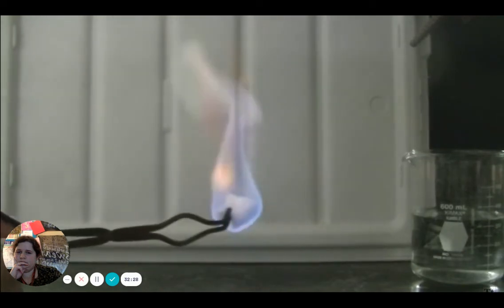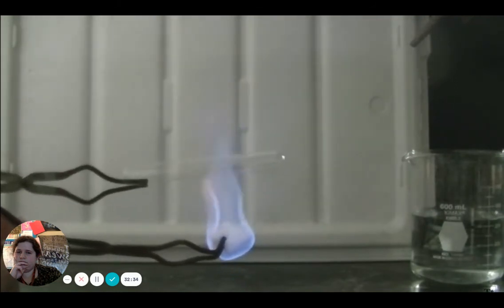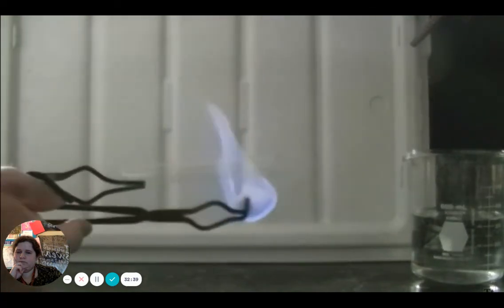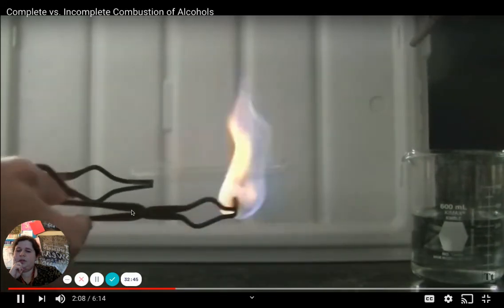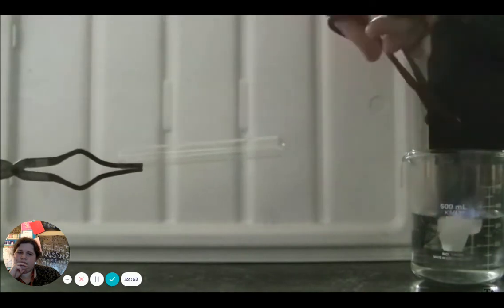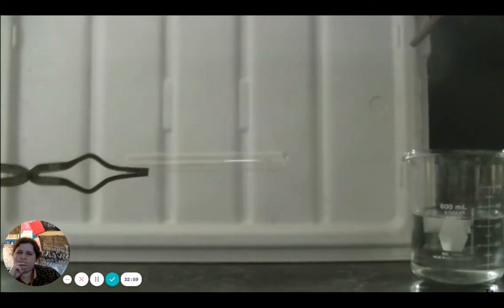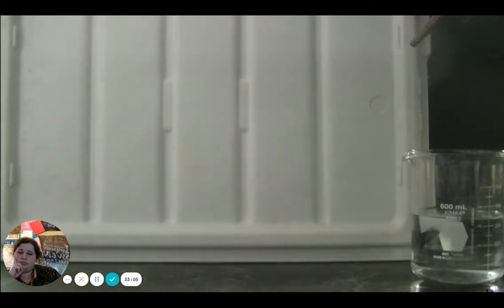Now, to show that no soot's being formed, I can take a clean test tube and place it in the flame. I'll run that back and forth. I can actually see some condensation of product water on the test tube originally. Now it's sort of burnt off. So we're trying to see if any black residue is left behind in the film. Sometimes I can blow that out, but oftentimes we have to just stick it in a beaker of water. But if you look at the test tube, you will not see any soot. It's clean. That's evidence of complete combustion. No waste.